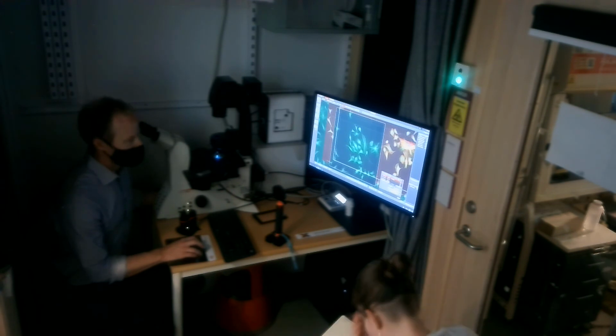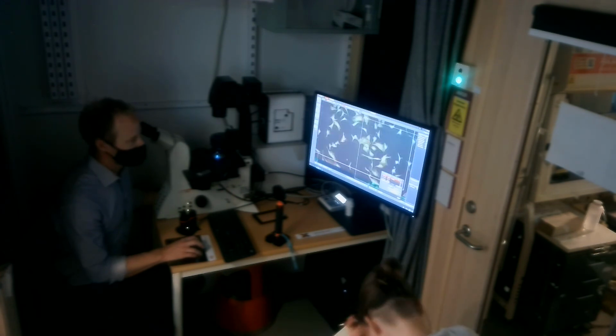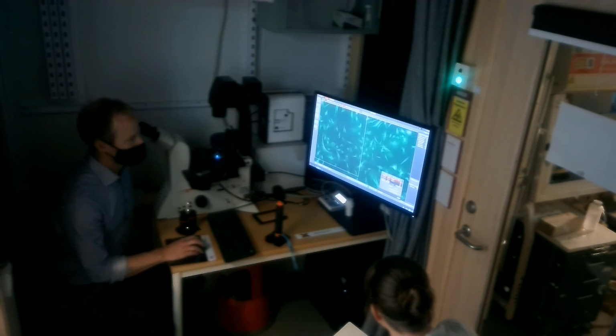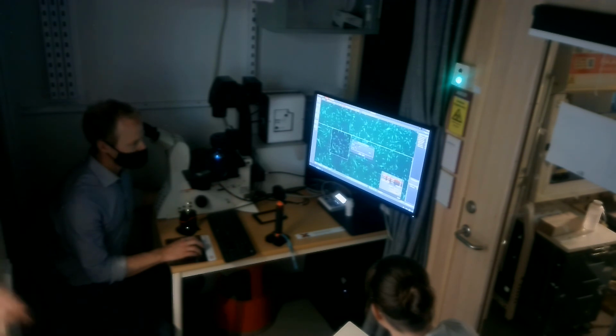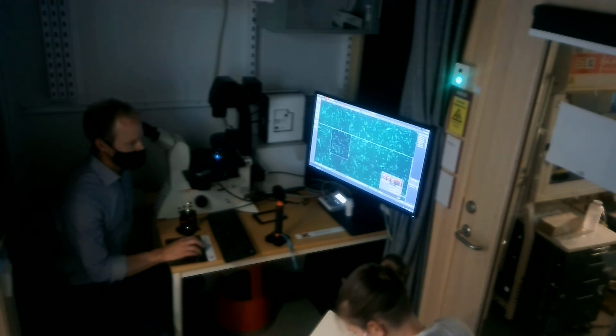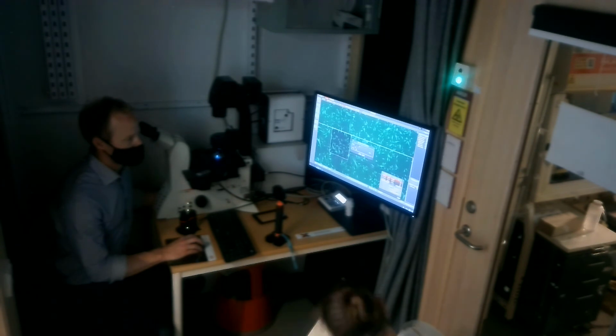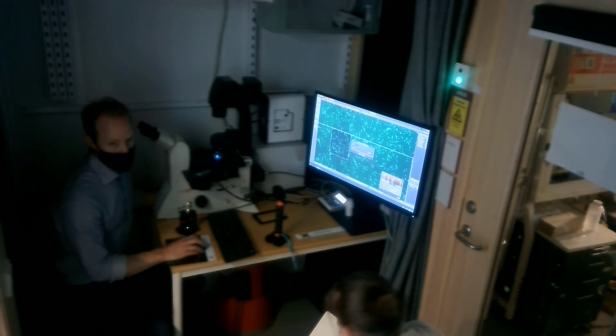However, I think, let me see. Yeah, so it goes through and tries to find it, but this was the first time I did. Here you have the settings for the autofocus. You have fast, if you have this one over here, and on the other side is precise.